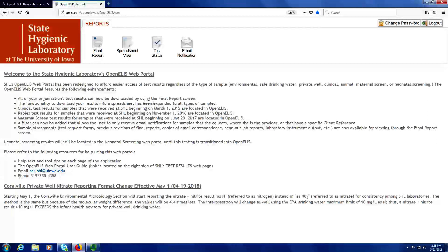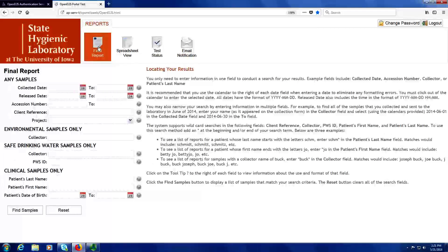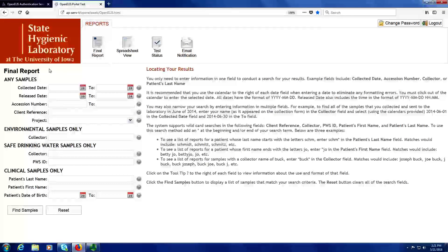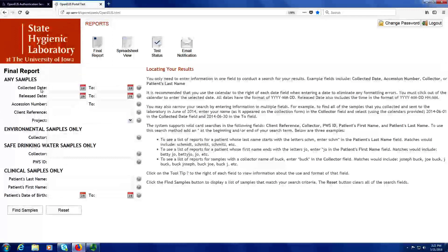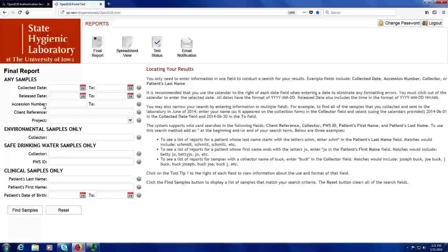In order to download your results, you'll want to click on the final report button at the top. You can search for your samples by any number of fields and any combination of fields. You can search by a collected date range, a release date range, one or more accession numbers including a range of accession numbers, by a client reference, or a project.